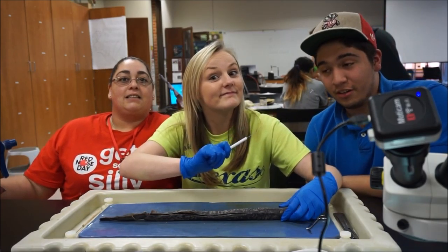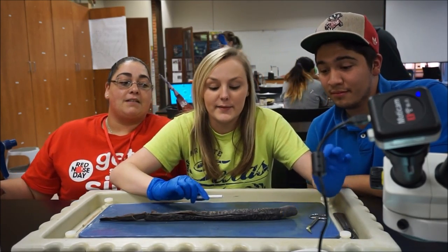Hi, I'm Brandy. I'm Andrea. I'm Erica. And this is our lamprey dissection.